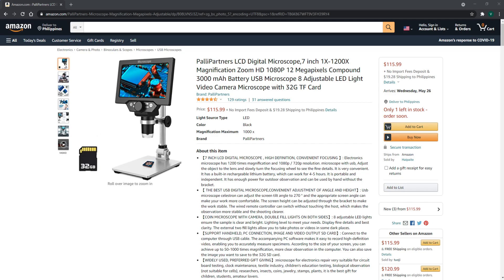You can adjust the object to the lens and slowly turn the focusing wheel to see the fine details — it is super convenient. It has a built-in rechargeable lithium battery which can work for 4 to 5 hours, and it is portable and independent, with enough power for outdoor observation and can be used by hand without the bracket.